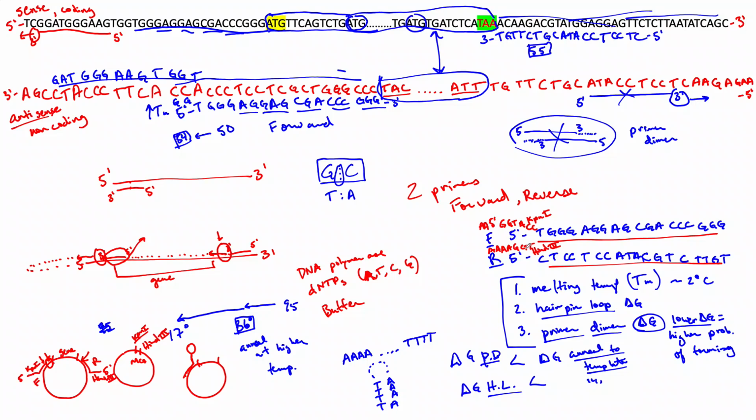Okay, so that's a complete primer then. It has 3 parts: the sequence that's complementary to your template DNA, the cut site, which is compatible with the cut sites in the multiple cloning site of the vector that you're putting this DNA into, and then a couple extra bases at the end just to improve the efficiency of the digest once you actually digest with the restriction enzyme. So those are the 3 parts that the primer has. Again, the forward primer would have a sequence that starts 5', AA, GGT, ACC, TGGG, etc. The reverse primer would have a sequence of 5', AA, AAG, CTT, CTCC, etc. Those would be complete primers. I would send those off to a company and wait with bated breath for them to come back so that I could start my cloning experiment.